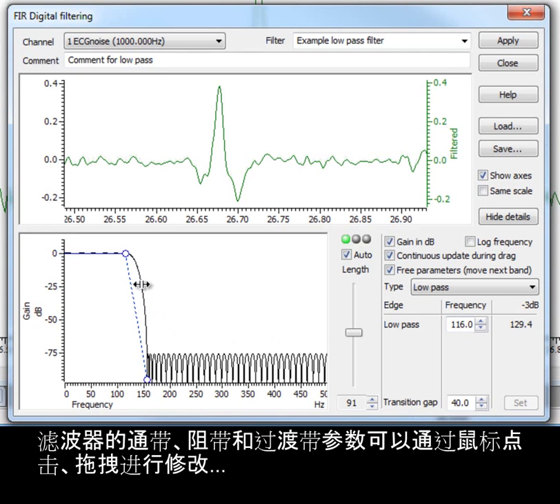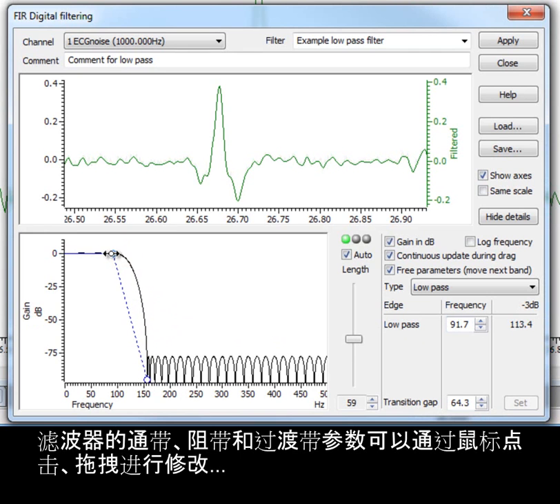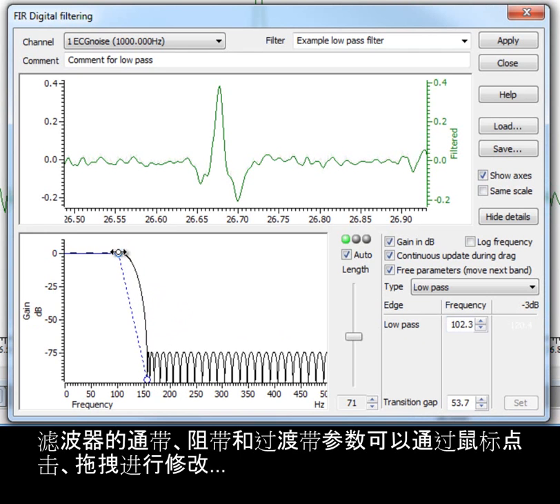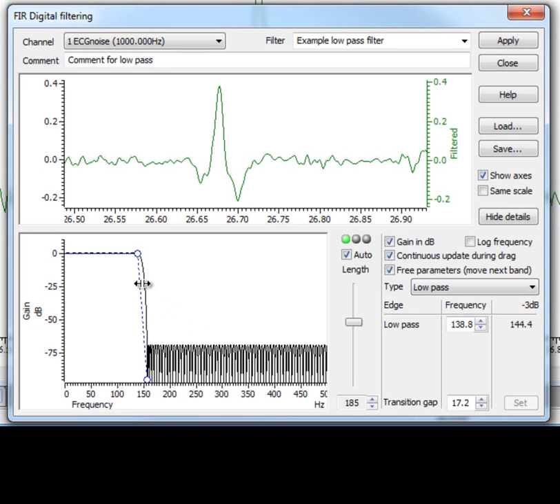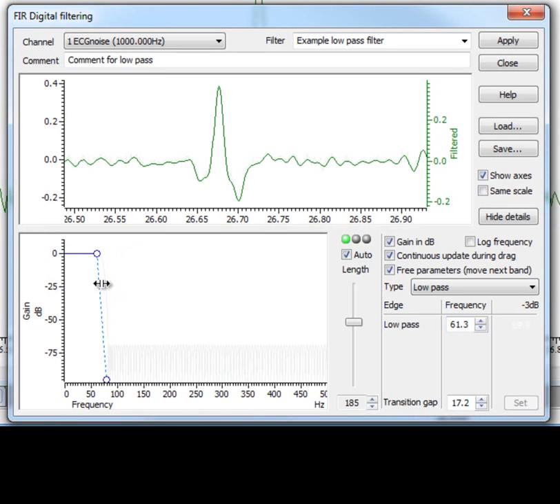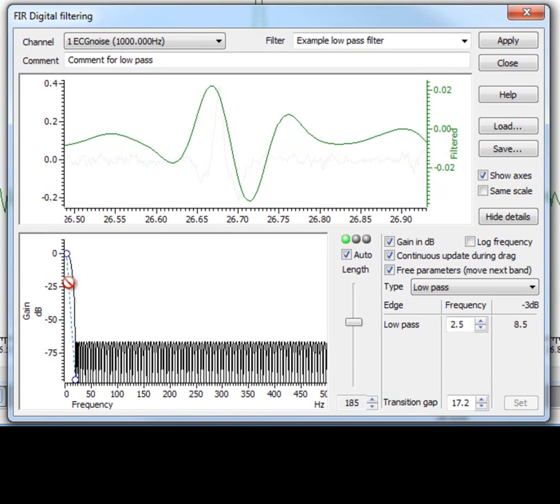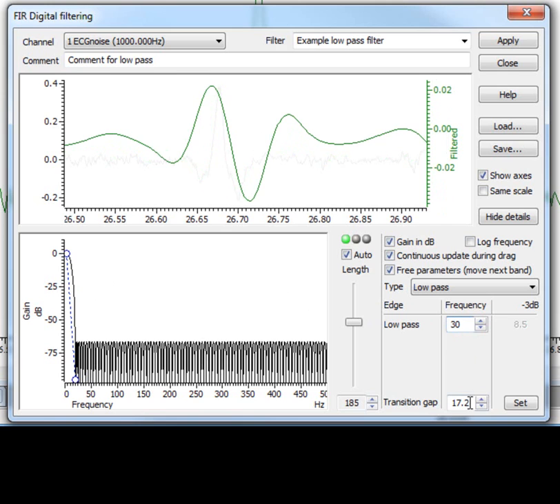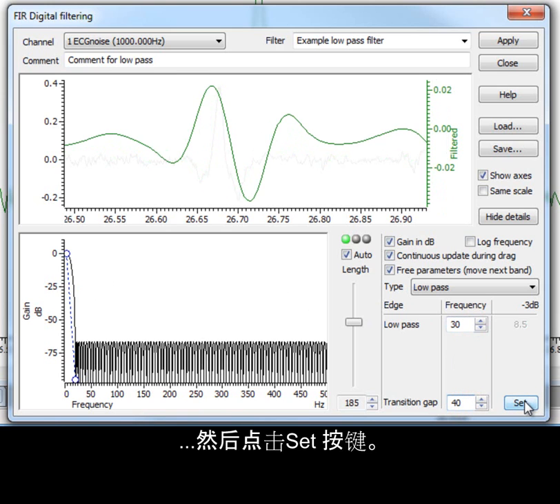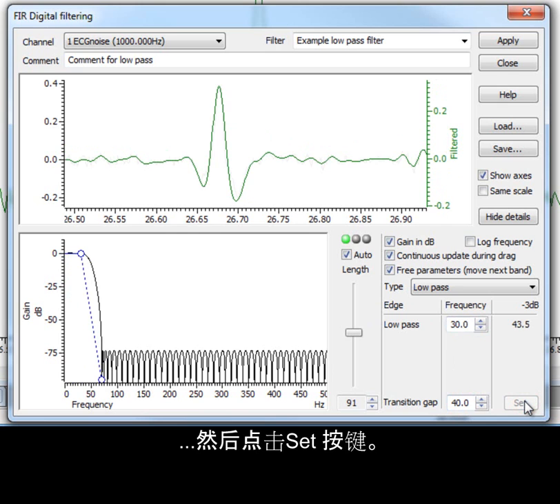Pass bands, stop bands, and transition gap settings of your filter can be edited by clicking and dragging with the mouse, or you can edit the settings directly in the appropriate fields of the dialog and click the set button.